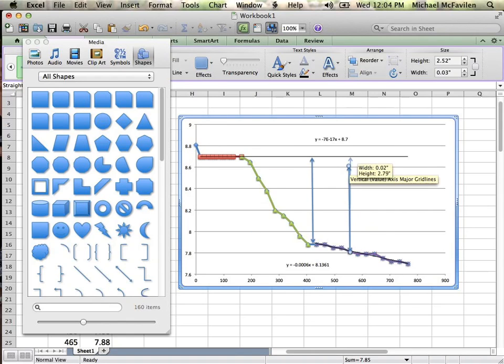You'll notice the line is a different length, and that's because our two fit lines aren't perfectly parallel. They are slightly askew, which means your changes in volume will be different. And we can even throw up that last one just for the heck of it, right? There we go.